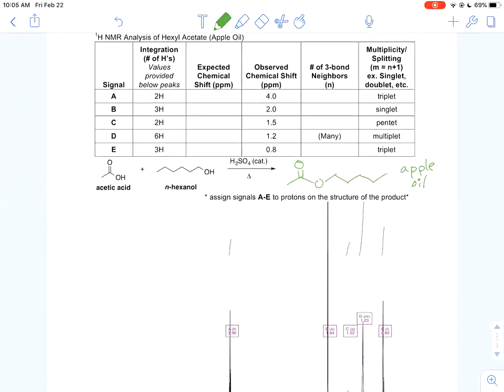So you'll notice that the integration is provided because it's a little bit wonky. So I want to explain that a little bit. I wanted to show you that the splitting patterns are actually given and the symbology as well. So really what this video is about, it's not for me to do the assignments for you because it's very similar to what we did for banana oil. It's just to show you some differences in the spectrum.